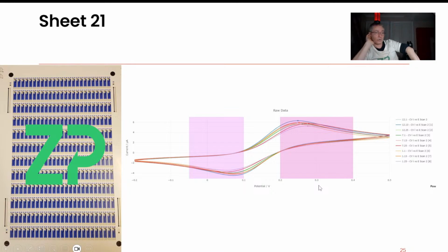In fact, we had a question a couple of weeks ago, or last week, from someone who was doing work on a caffeine sensor. And their complaint was, oh, well, actually, they're not reproducible. But I genuinely was able to bring up, we just happened to have some caffeine data ourselves. We were just doing it in duplicates. But they were really reproducible.